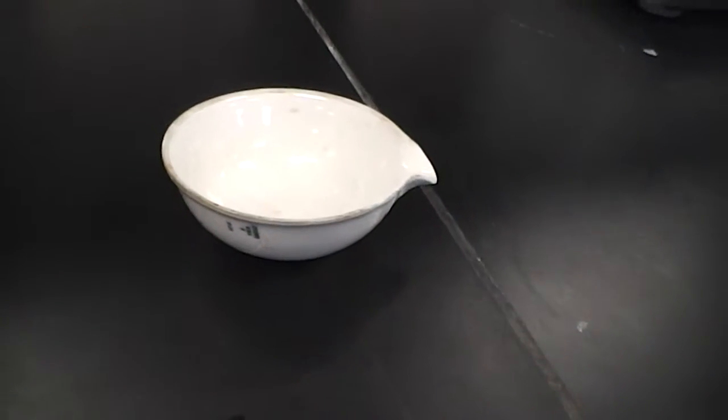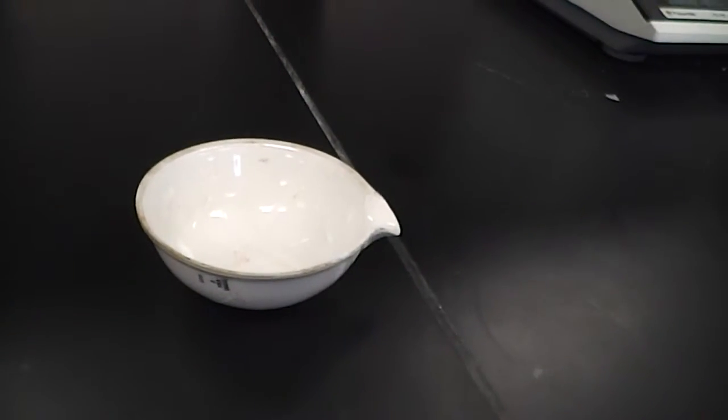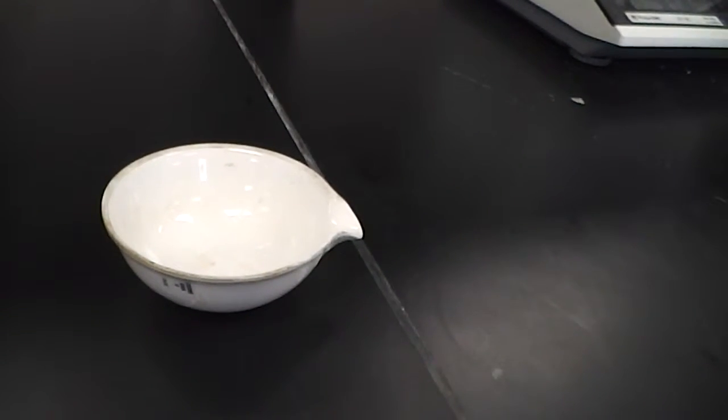An evaporating dish is used when you have a liquid that has a solid dissolved in it and you're trying to get that solid out.